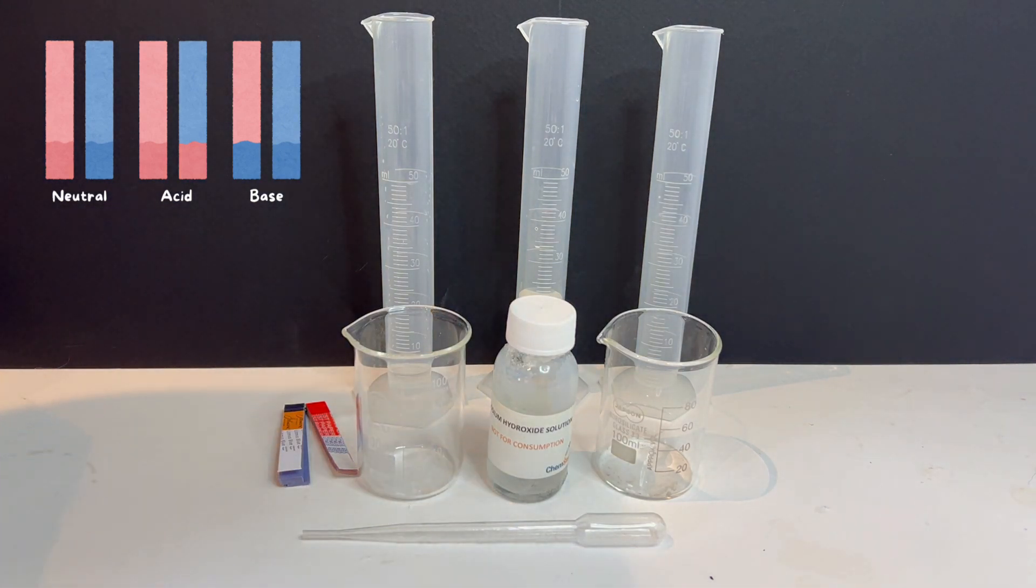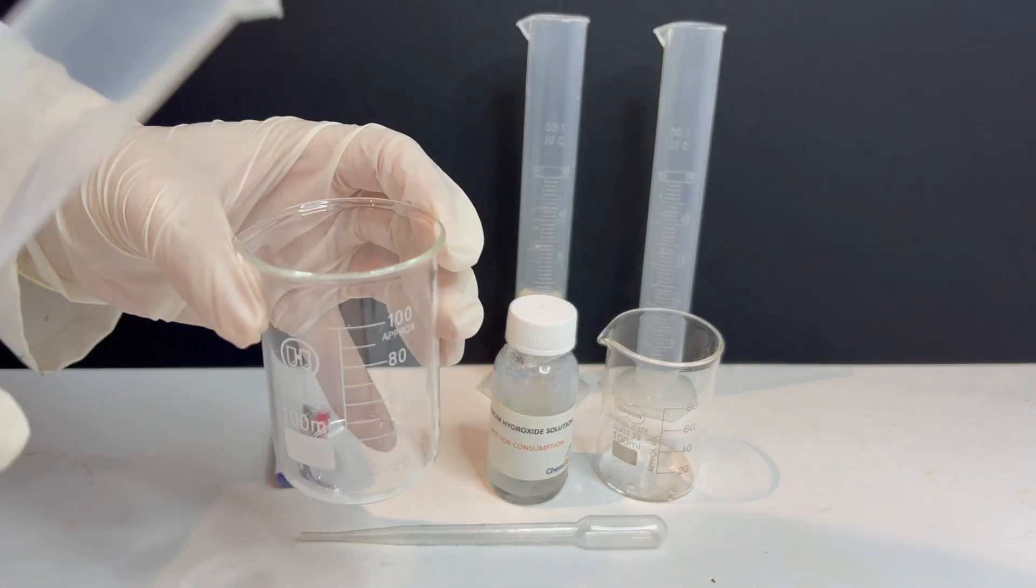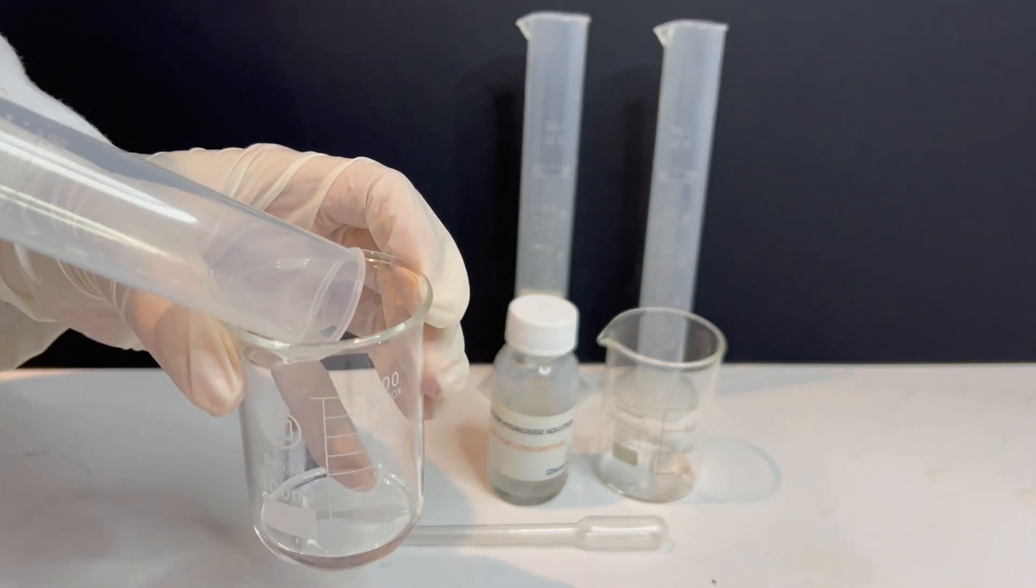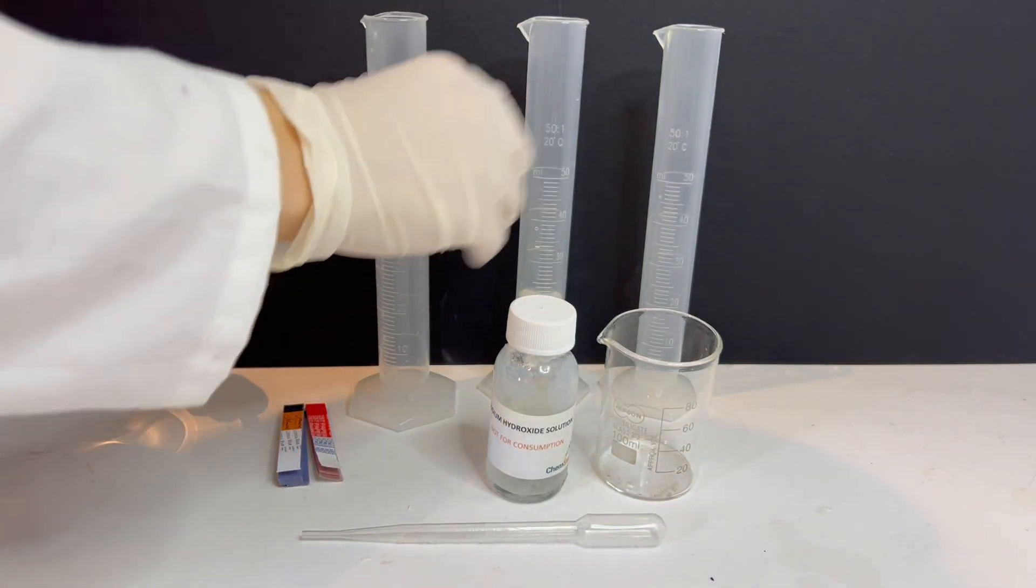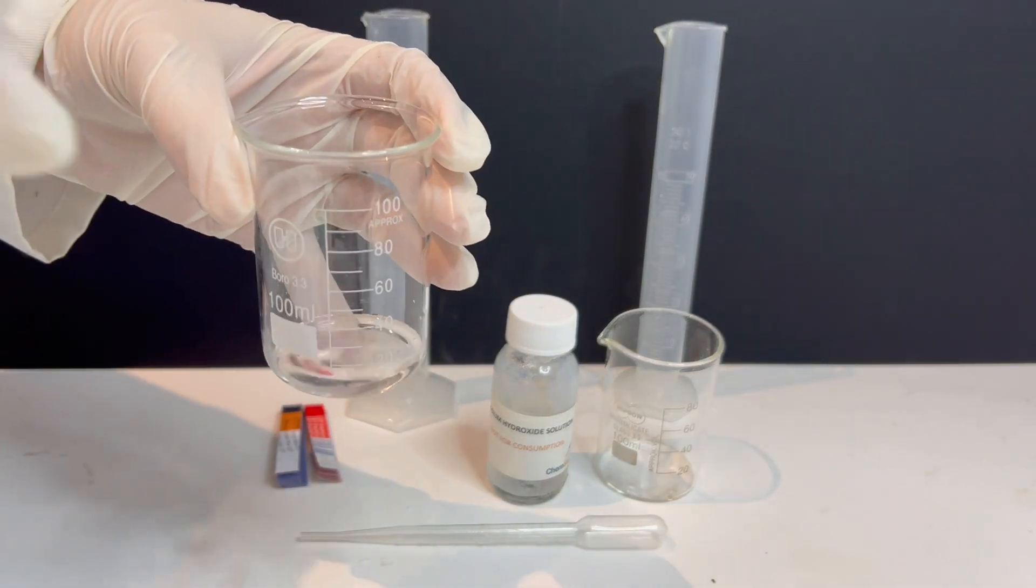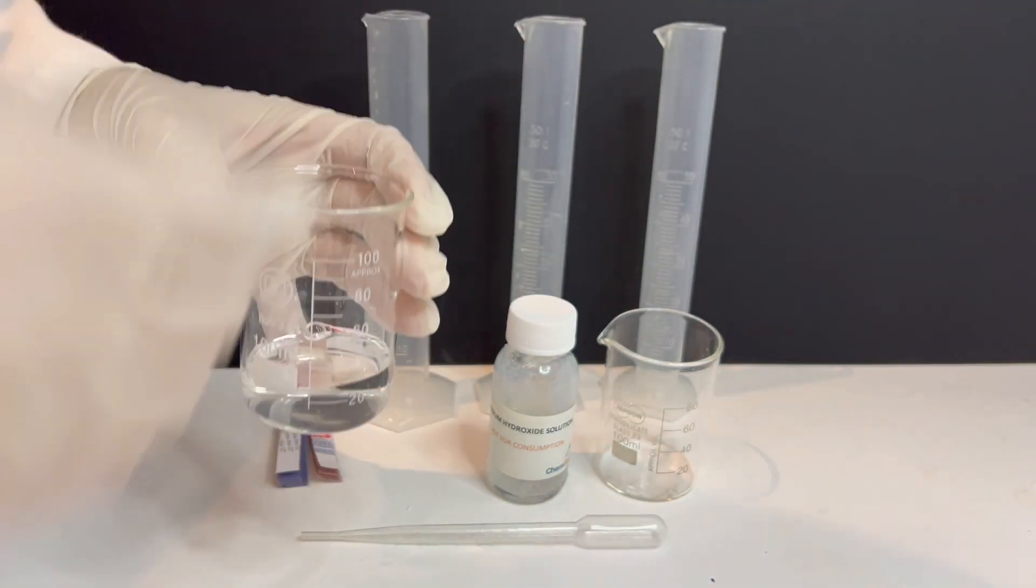First, I pour 5ml of vinegar into a beaker and then I dilute it with about 20ml of water. Diluting the vinegar slightly helps us see the reaction more clearly, while still keeping it acidic.